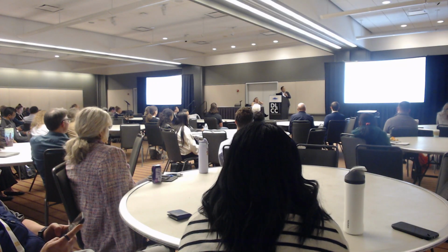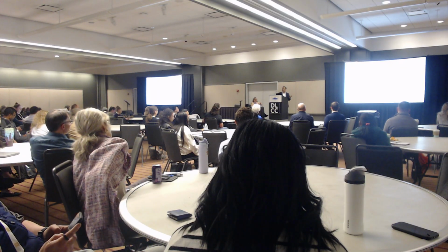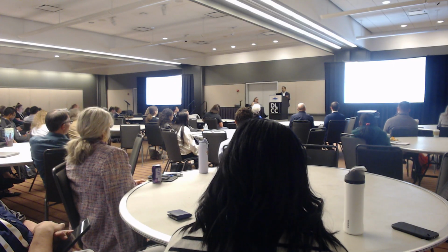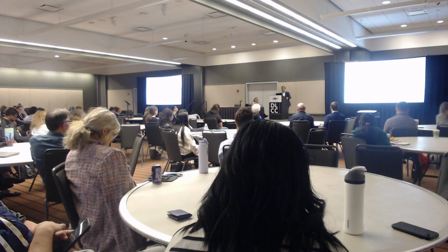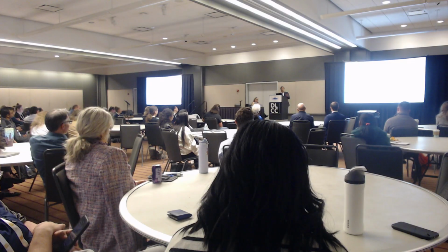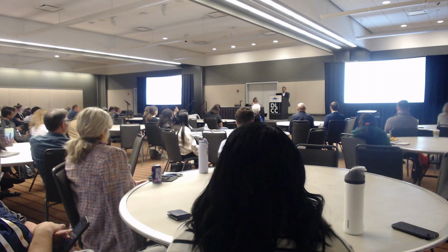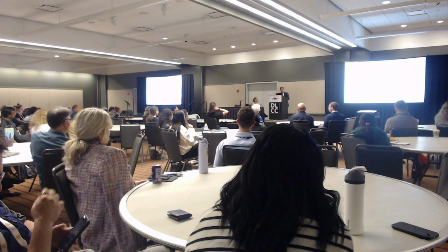We didn't want to do that, and I'm a scientist myself. I was like, okay, there are published protocols. Why can't we use these protocols and add some QC steps to make it cheaper and more controllable? The other reason we wanted to optimize the whole protocol in our lab is that if you use Dovetail, Arima, or any commercial kits, those will definitely work, but you have to follow their antibodies and dilutions. We have years of experience doing ChIPs. We have established all these antibodies. I didn't want to reinvent the wheel, trying a new antibody to see if those ChIPs will work or not. So we adapted this protocol, and we could use our old ChIP protocol in it.